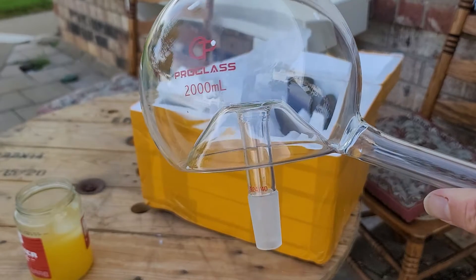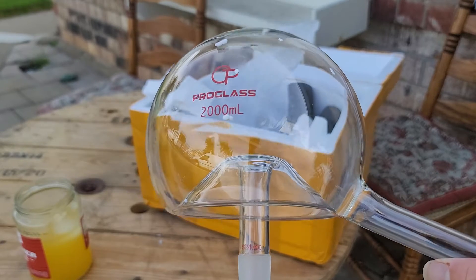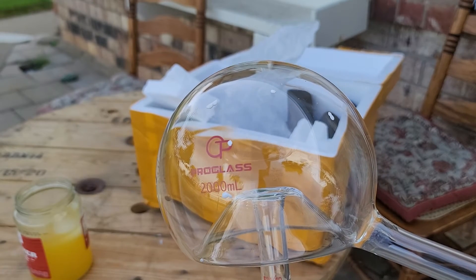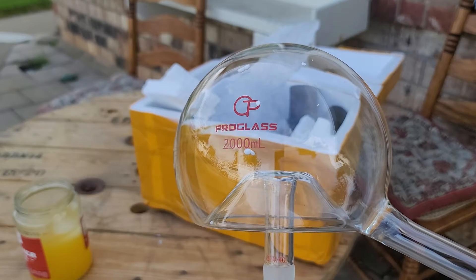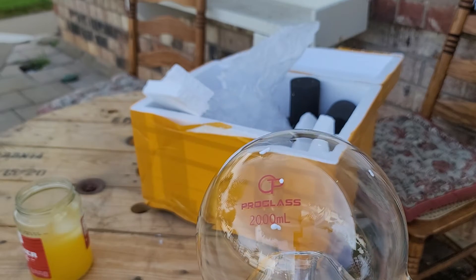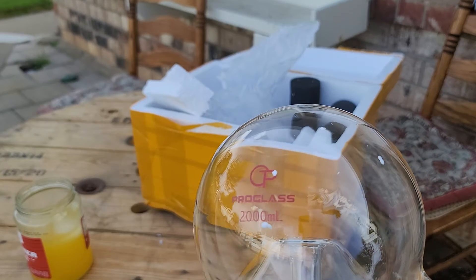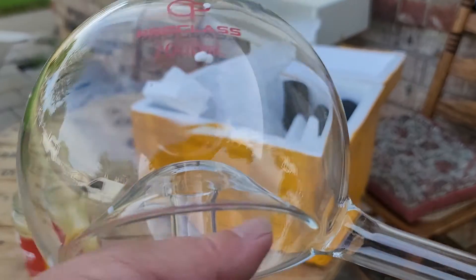I ordered one of these from Germany once, and the writing was in German. I used Google Translate — I got on the search engine and found a free online translator and translated some of that German language into English. And it said the Alembic was — the purpose of it was for the improvement of the water. And I think that's great.